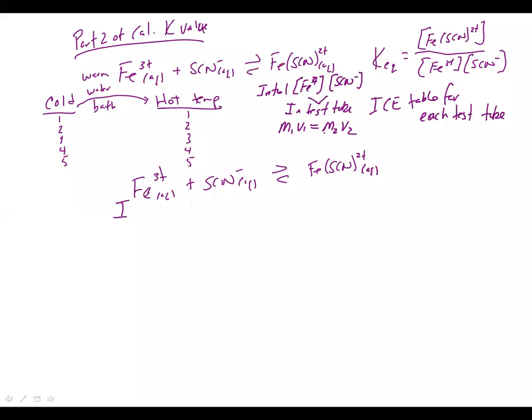So you want the concentrations of these in the actual test tube. We'll require you to do that calculation, similar to the concentration activity we did at the very beginning of the semester.